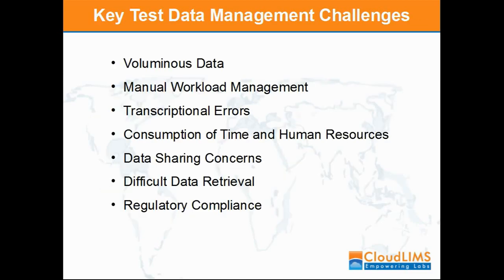So what are some of the common data management issues that the testing labs face? Use of paper-based methods for data management in testing labs hinders its operational efficiency as there is too much data to manage. This in turn requires enormous amount of manual effort that may lead to transcriptional errors.